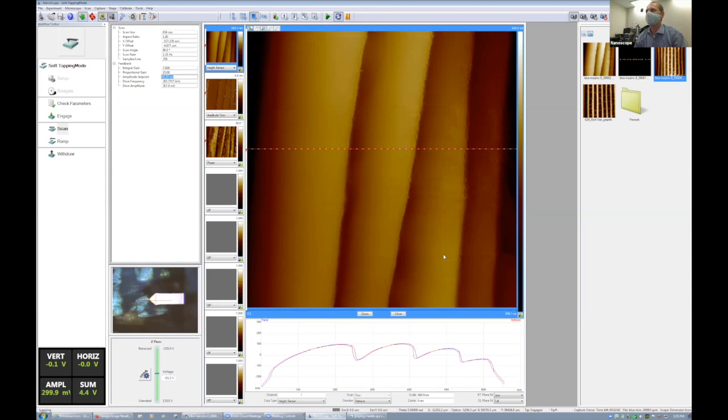How much does this tool cost, Marcin? So the SEM the other day, or just now, was $500,000. How much is this one? Oh, well, in that case, AFM is a bargain, only $150,000. The simple research grade AFMs, even the very good ones, usually top out at about $300,000.